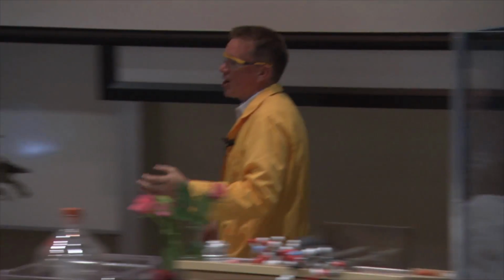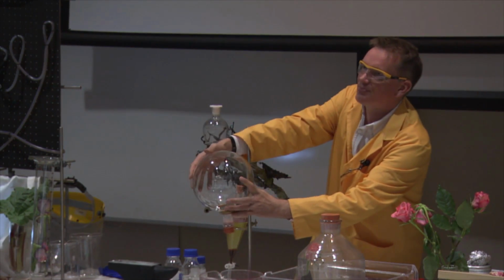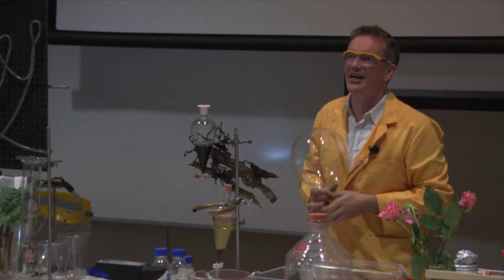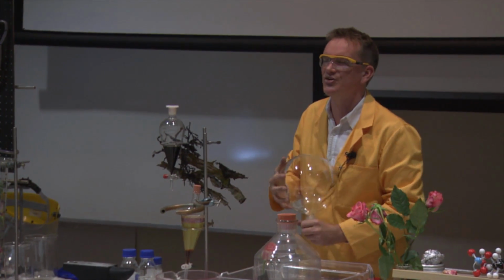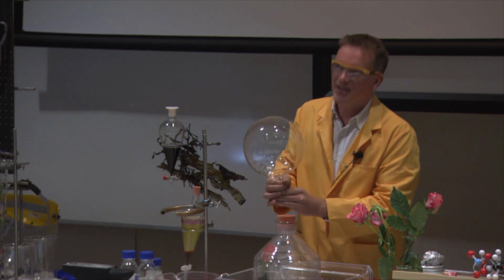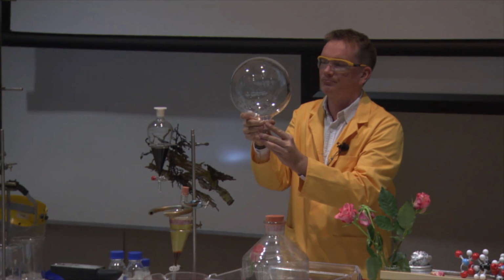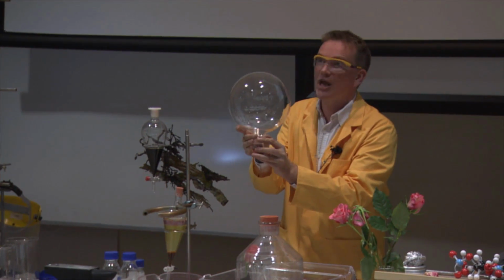Okay. Now I have some more ammonia in this flask. And I'm going to show you one other experiment here. Maybe we'll collect the ammonia back and then hand that out later, and you can smell it on the way out. Should we do that? So that'll perhaps be... Okay, so this flask is also filled with ammonia, and it's lighter than air.